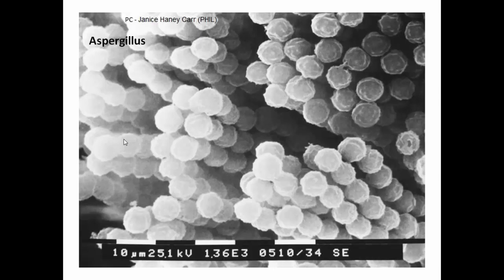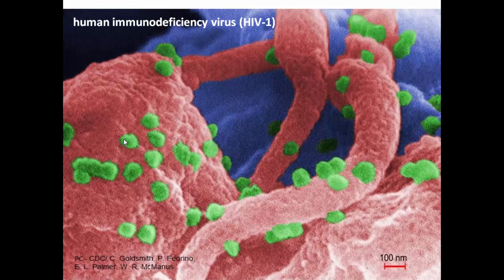This wonderful image is showing Human Immunodeficiency Virus, HIV type 1. Follow the cursor — these green dots are the HIV viruses. This large structure with pseudopodia-like extensions is actually a T-lymphocyte, and these individual green dots are the HIV type 1 virus particles.